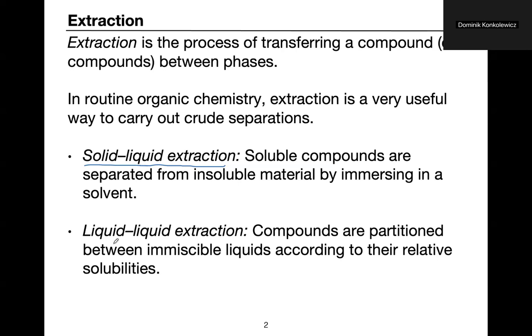Okay. In the context of organic chemistry, we generally will not use oils as our solvents because they're not very homogeneous, right? They can vary depending on supplier, etc. What we'll often use is the same principle of an organic and an aqueous layer, but where the organic layer is some solvent that's not miscible with water, right?